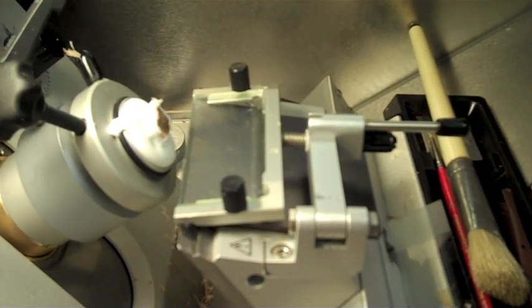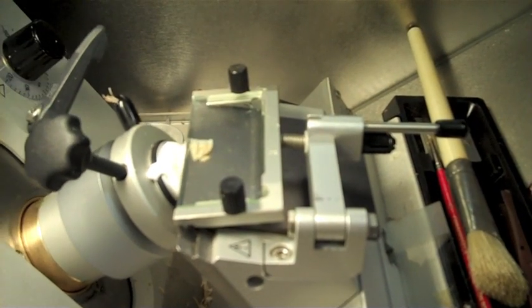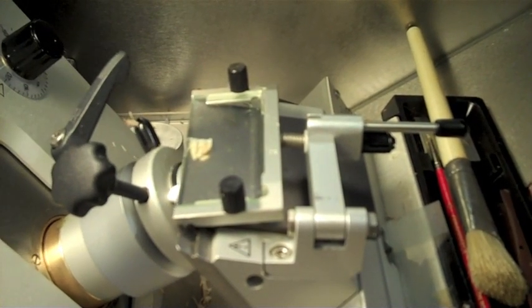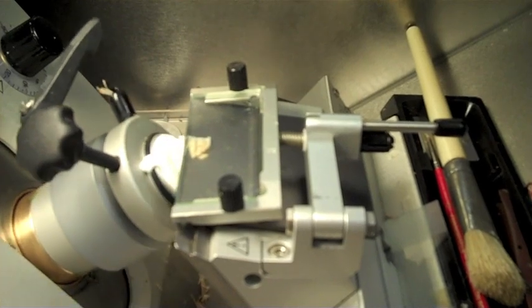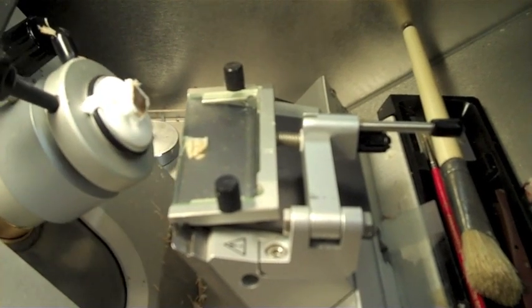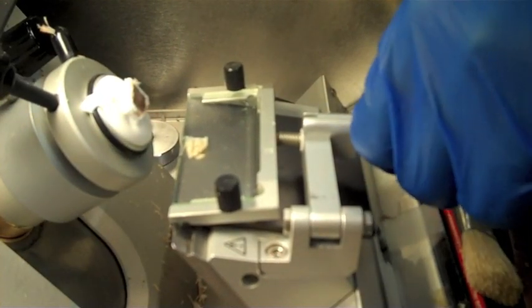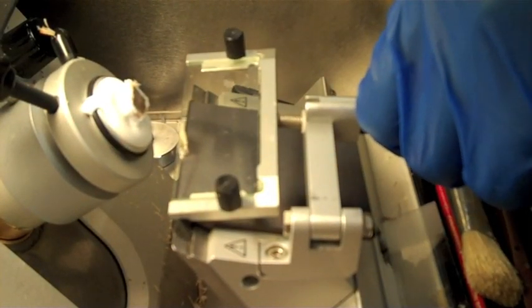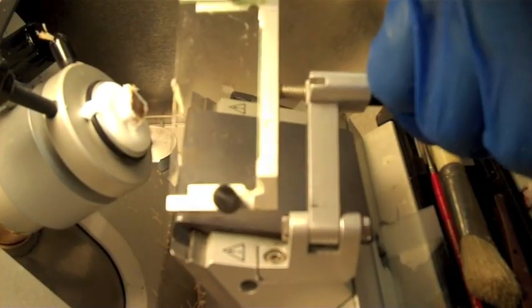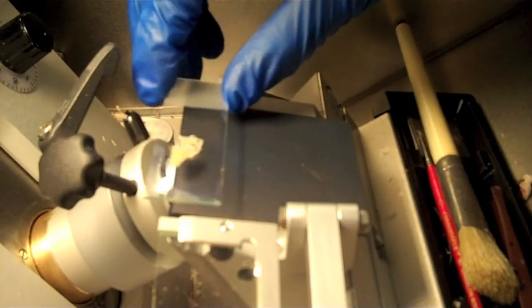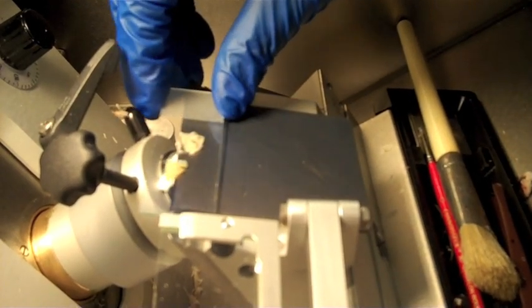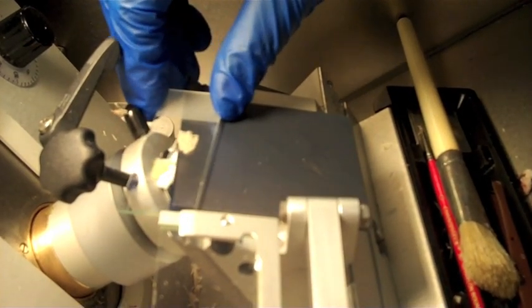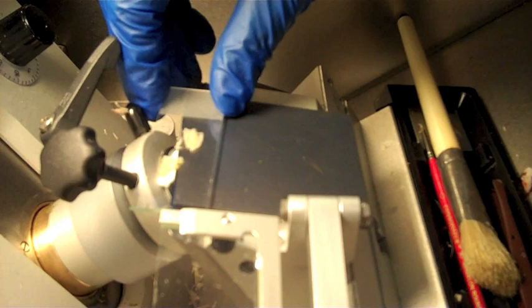You may have to cut many sections before you get a good one. Sometimes the sample may even fall off the stage. It is important to be patient. Collect as many samples as possible on your slide.